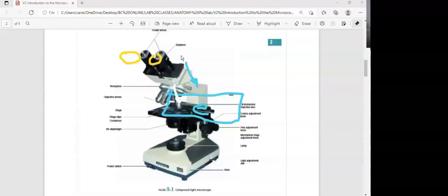If the lens is pointing down here, and the letter is in here, then how in the world are you going to see the letter E, right? This is the reason why you use these knobs right here. You use these knobs right there. So when you move this knob, the letter E is going to start moving over here. Right? So eventually the letter E will show up right here.